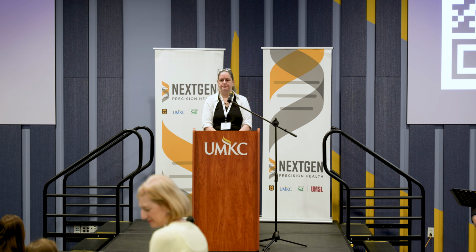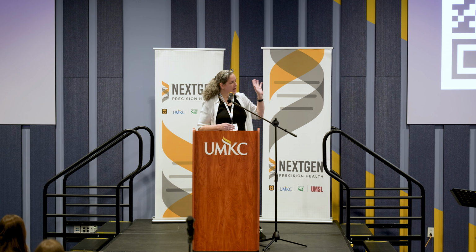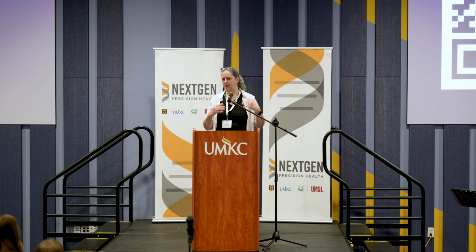Okay, Mackenzie, let's get a question from Mentimeter. One of our questions is, what program or tool did you use to quantify the live imaging behavior? Right, so this gives me a chance to talk about some new work that I didn't show today. What I showed in the talk I would call semi-automated. A lot of it's done in programs like ImageJ, where you have to click on the osteoclast in each frame, and it's very time-consuming. I did have a slide on this, but didn't have time to cover it. We're moving now to AI-based methods, which has been a little tricky to get to work in some of these movies because there's so much change over time, and some of the automated programs just don't handle change that well.